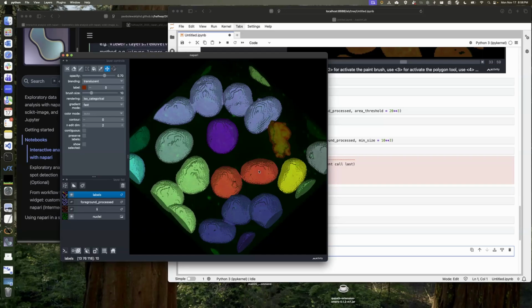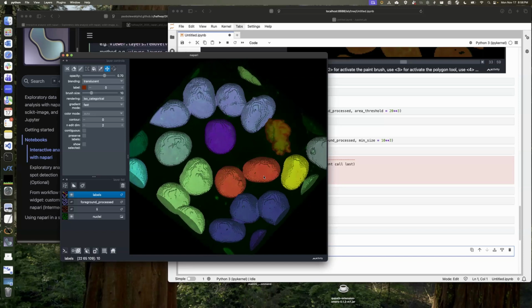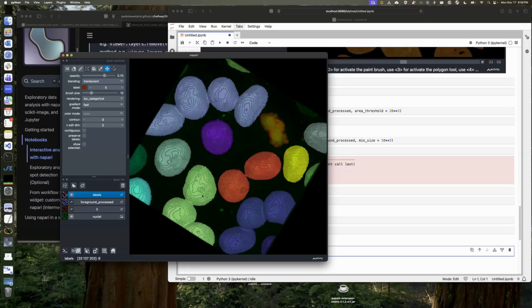So you would fill this basin from the bottom. In order to do that, we need to know where to start filling. Traditionally, this is called a marker-based approach, where you put a marker, a point, in every single object that should have its own basin. We could actually do this in Napari pretty easily, which is kind of nice, but it can be a little tedious.